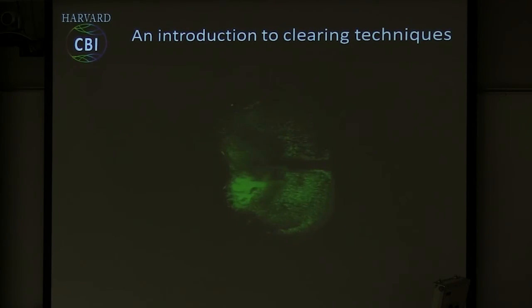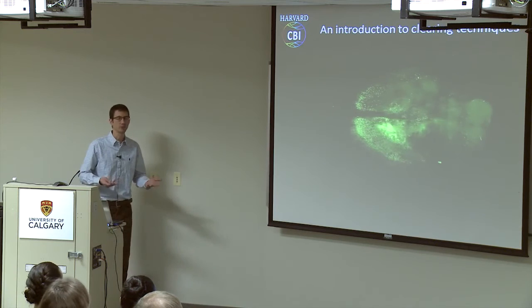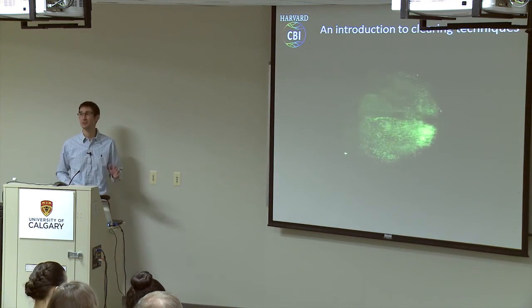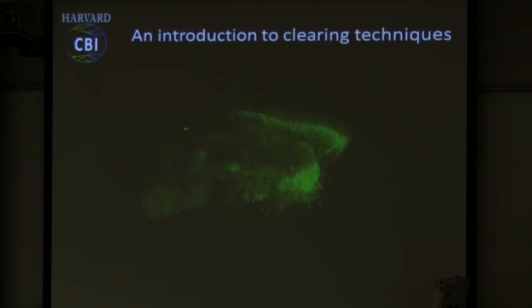Cool. So that's basically sample prep. Obviously, you've got to start thinking a little bit differently. It's not your microscope slide and cover slip that you're used to. But personally, I find it way easier than slides and cover slips. I'm the king of air bubbles with cover slips. I have never been able to cover slip a slide properly. So this microscope has saved my career.